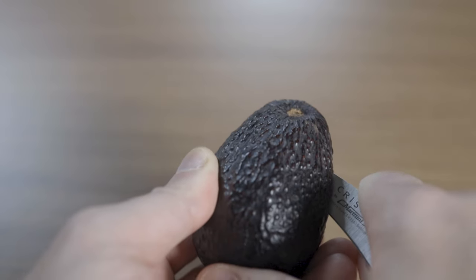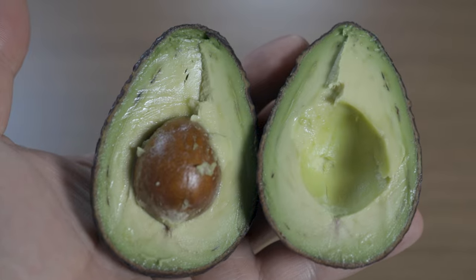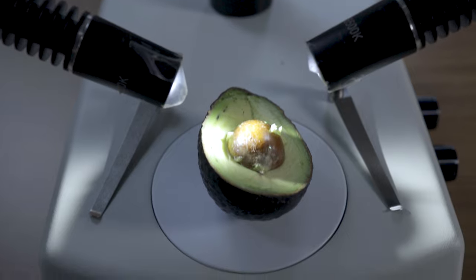Avocado skin is very strong for a reason. It keeps the fruit intact and protects the seed. Let's put it under the microscope and take a closer look.